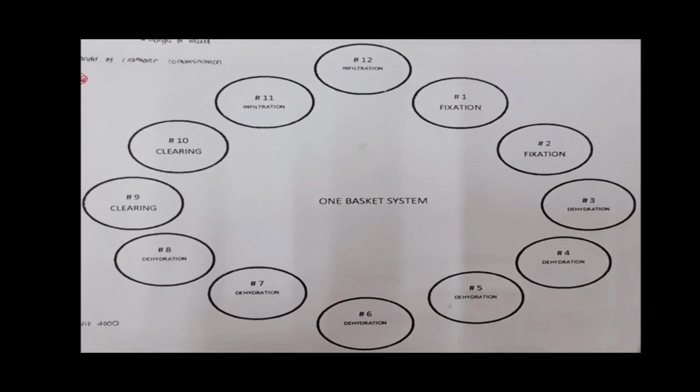So you'll be finished by basket 5 at 10:30 p.m. Then continuing dehydration, basket 6 to 8, that's 1 hour each. So from 10:30 to 11:30, 11:30 to 12:30 a.m., 12:30 to 1:30 a.m. So by 1:30 a.m., you are done with dehydration without human power.